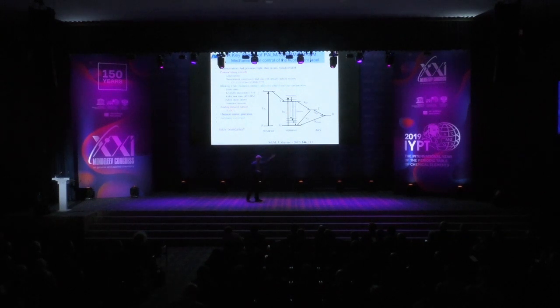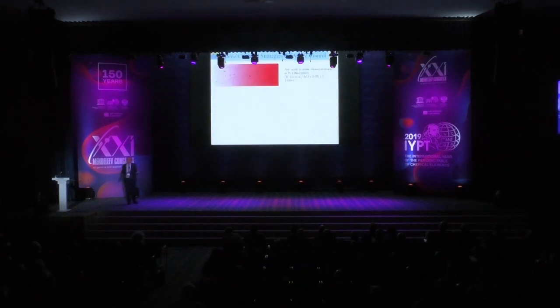So this is what blinking is coming from: a variety of processes, for example, photoreduction of the molecules with certain additives. And there are other mechanisms. Even to give you a little more flavor for the diversity in this area, but the need for more ideas, on the top I'm showing you a precursor molecule that's converted to a fluorophore.